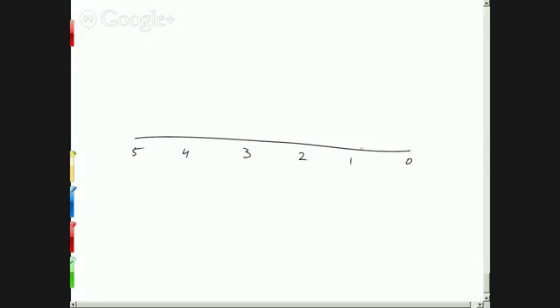And right at 1, there's a really big singlet with 9 hydrogen integration. And I'm going to put an S for singlet, just so we don't always have to draw the little splitting. We could say, look, that's a singlet for 9 hydrogens. Then just before 2, there's a smaller singlet. Singlet meaning just one peak. And here's a singlet with 3 hydrogens.